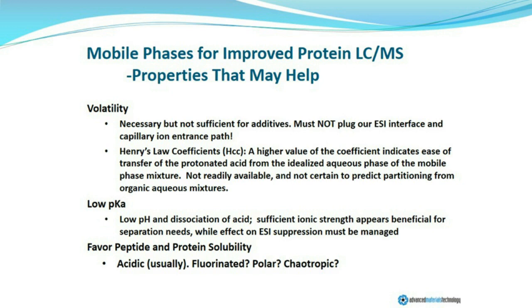It is frequently overlooked, or in some cases unthought of, that if your sample doesn't remain fully soluble, then useful interactions with the chromatographic surface or proper ionization and electrospray processes will be impaired. So it remains difficult to say exactly what characteristics would best predict these requirements.